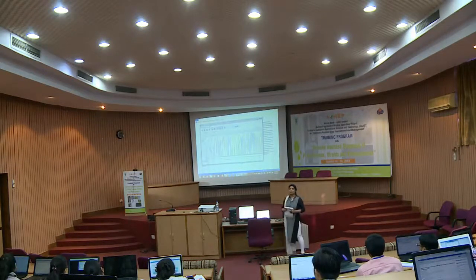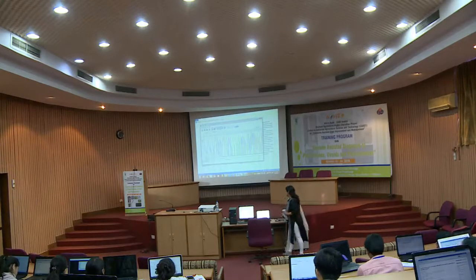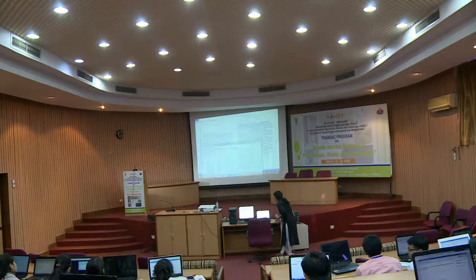Okay, now once the Contig has been formed, you have already saved that Contig with you. Now you want to verify that all bases should be good enough. Suppose I had somewhere, okay, I will make one Contig. What I will do, I will try to pick some region.